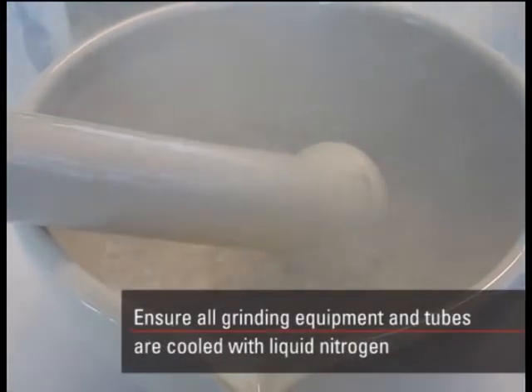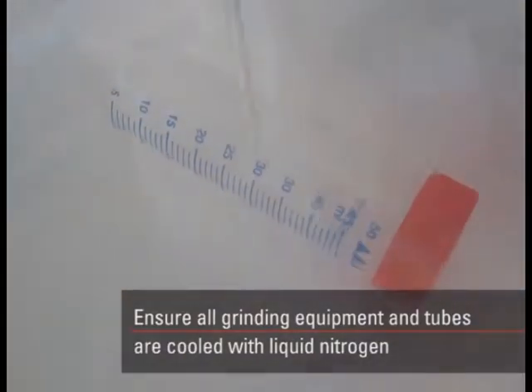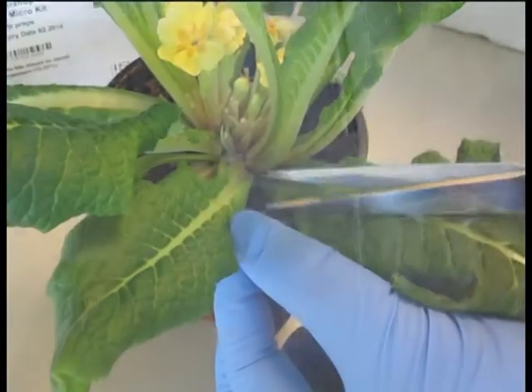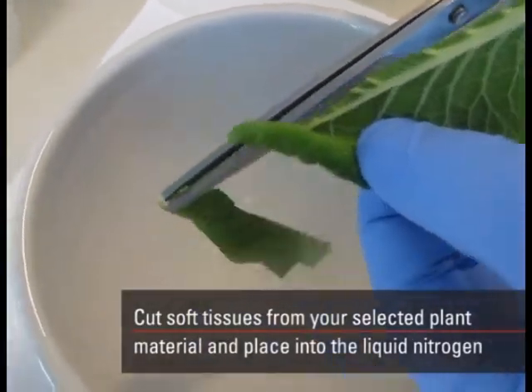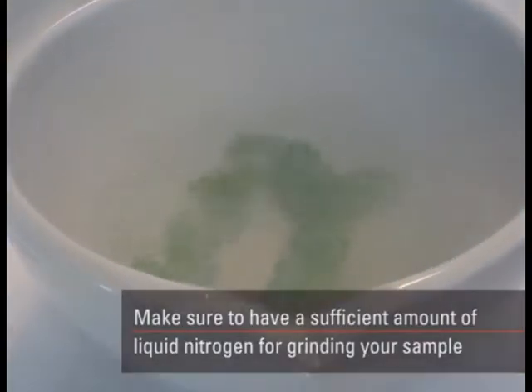Ensure all grinding equipment and tubes are cooled with liquid nitrogen. Cut soft tissues from your selected plant material and place into liquid nitrogen. Make sure to have a sufficient amount of liquid nitrogen for grinding your sample.